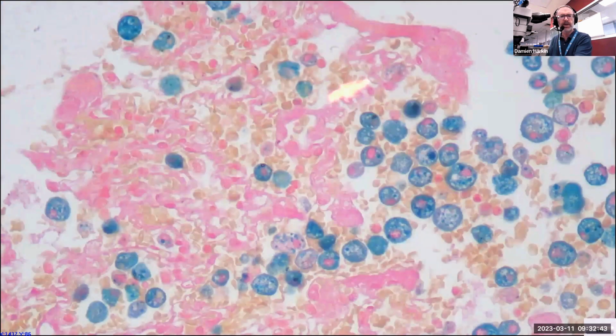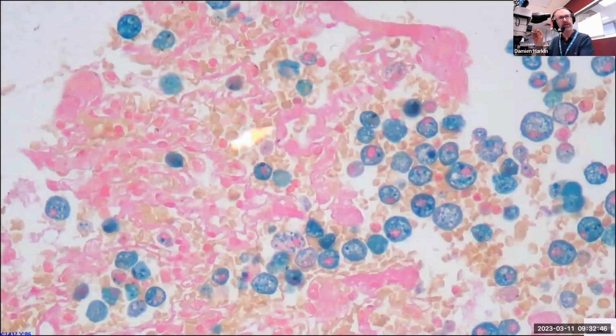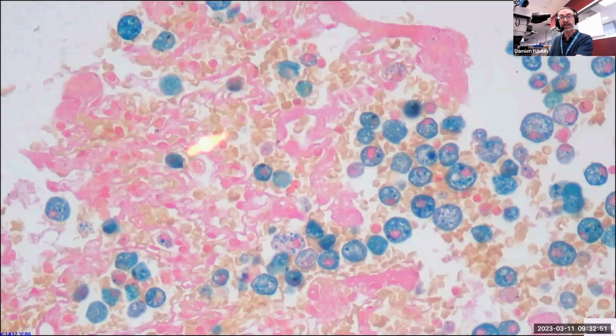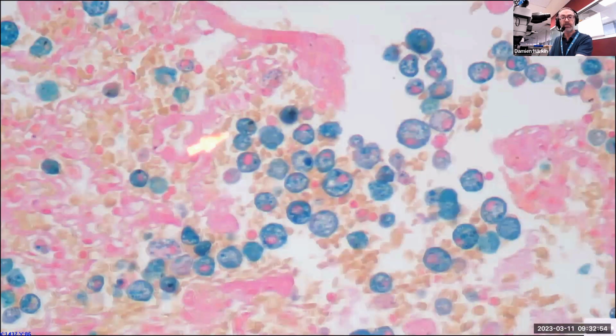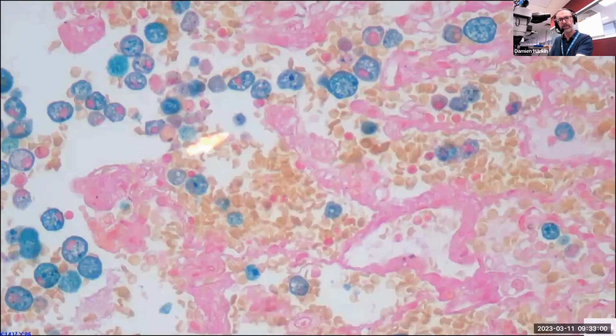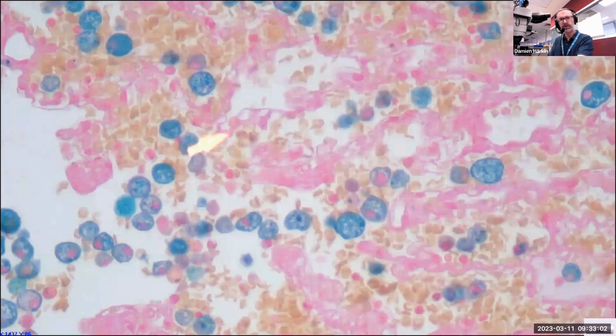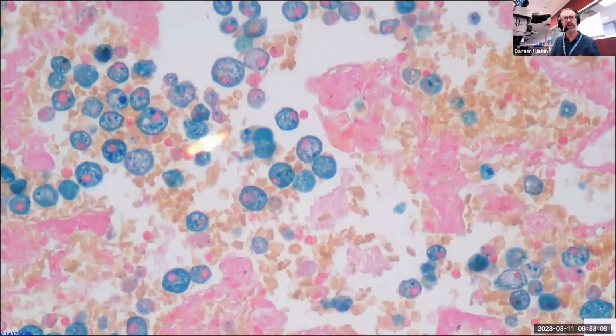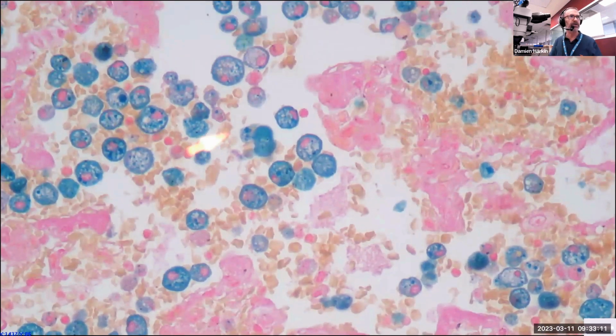And then we've got the yellow picric acid, being a relatively smaller dye, partitioning into those red blood cells. So it's a lovely outcome, isn't it? That yellow, pink and blue together. And the pathophysiology here of what we're seeing in this bit of very hemorrhagic lung tissue, in response to the excessive amount of bleeding that's taken place, there will naturally be a breakdown of those red blood cells over time. And so what we see here is referred to as histiocytes, these monocyte-derived cells that have come in to clean that up and to obviously ingest that iron-rich material.